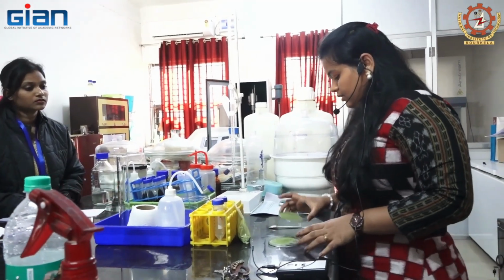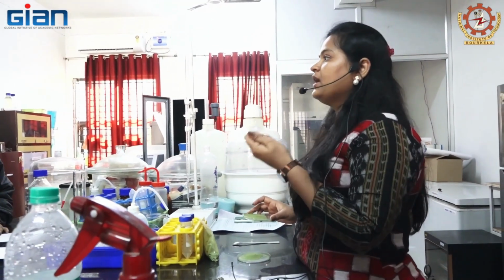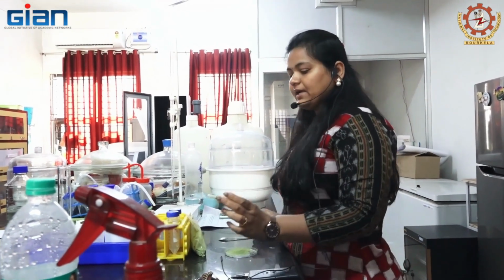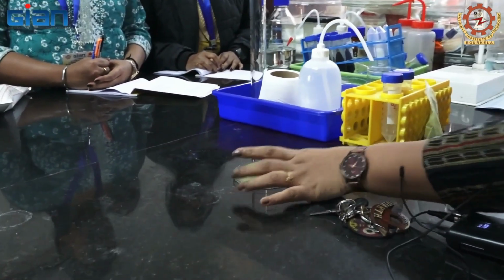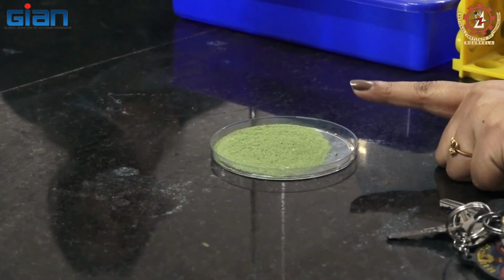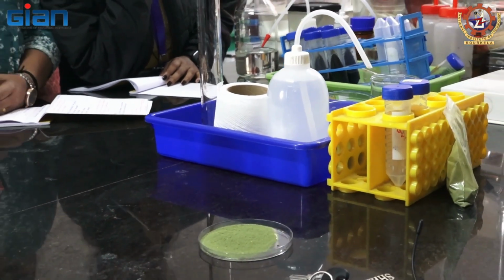Okay, you have already known the bell leaf. It is of very high nutraceutical, pharmaceutical, and also cosmetic importance. This is the bell leaf powder. The sample we will use is the bell leaf powder. It has been dried, ground and sieved properly to a constant particle size, so that our extraction procedure will be uniform. Then first, we'll explain the ultrasound assisted extraction.